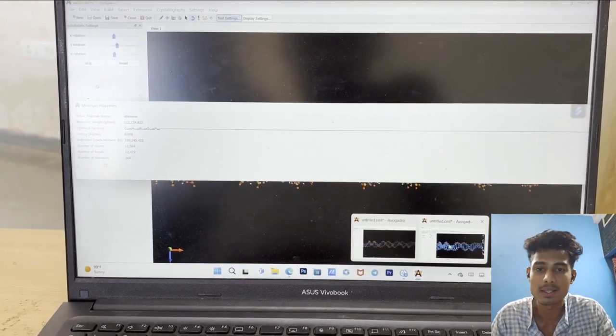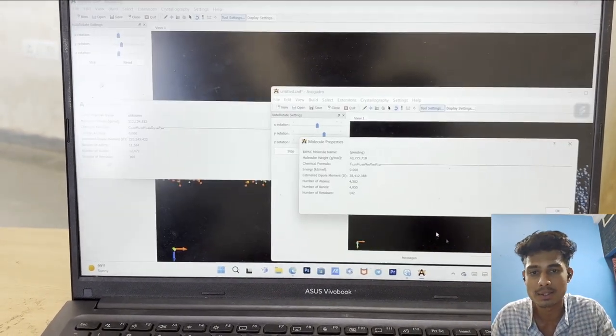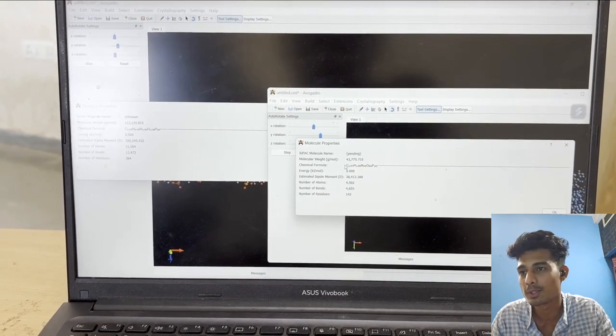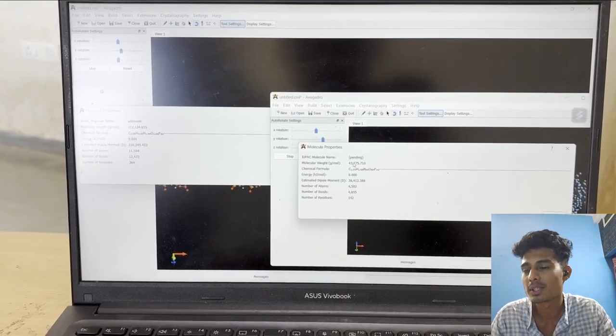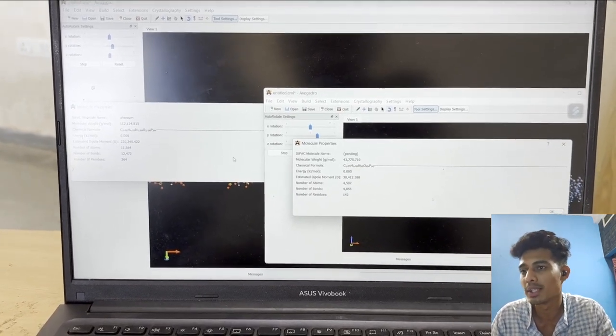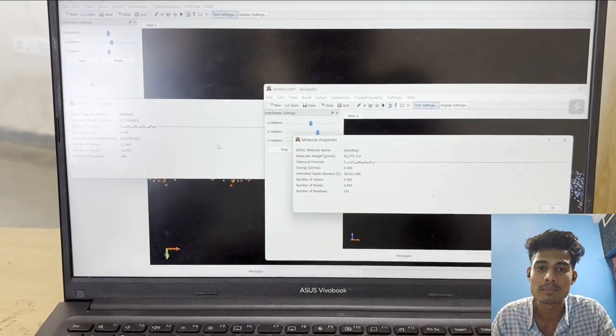We compare it to the other DNA sequence. The molecular weights and the formula we see are different.